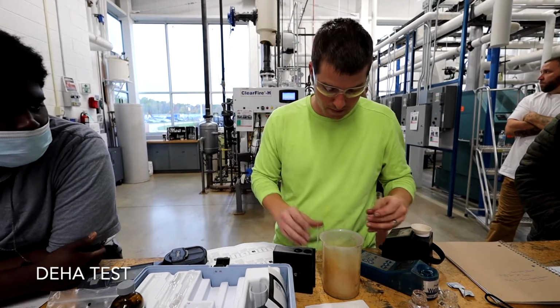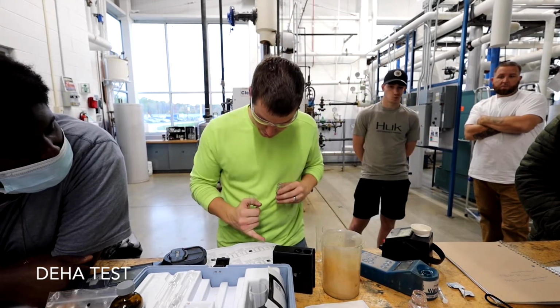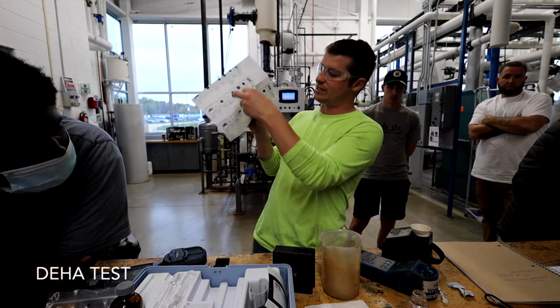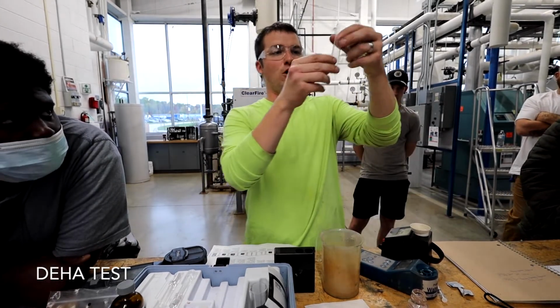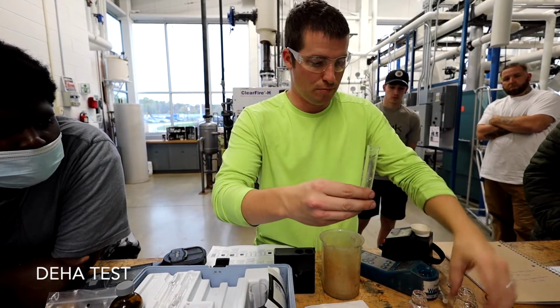All right, so we'll fill these up now. We're just filling it up to this bottom line, right? It says here to the 5 milliliter line, which is that bottom. It's 5 mils, but it just shows you your arrow. It's the bottom of the frosted part. All right. Okay, so that was our blank.